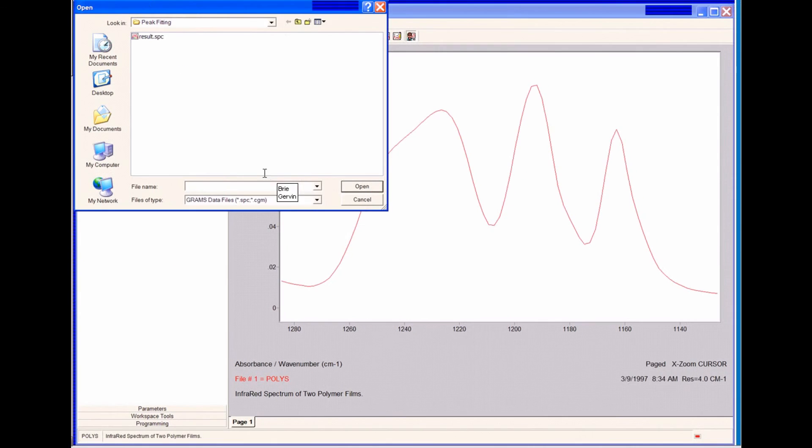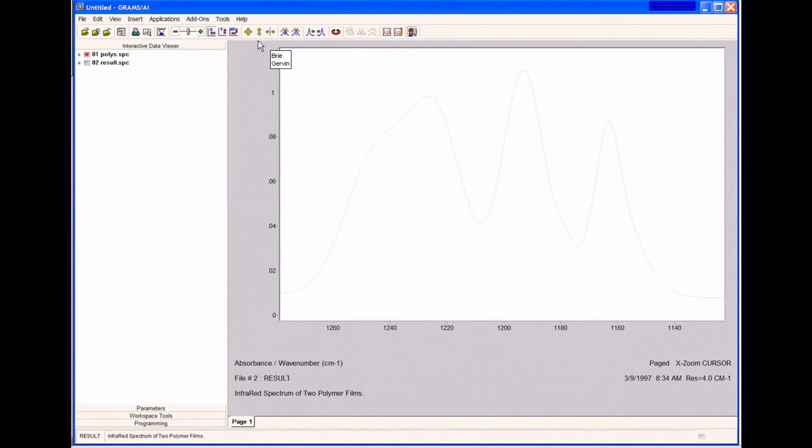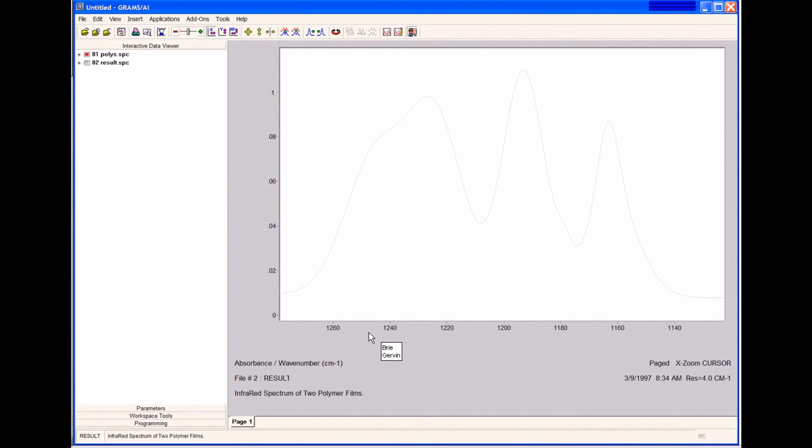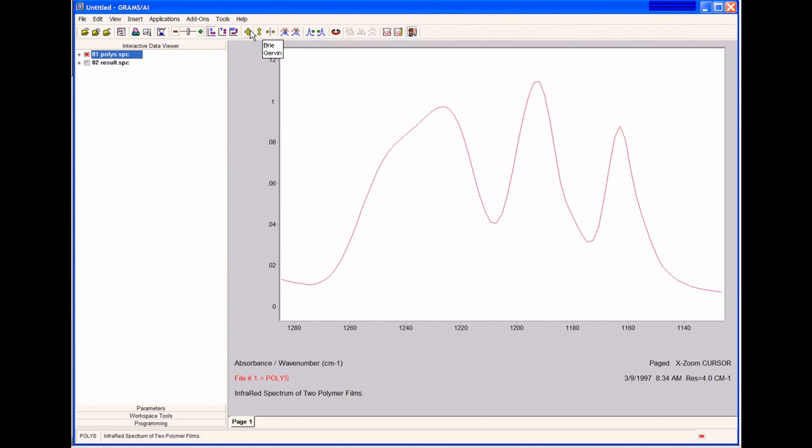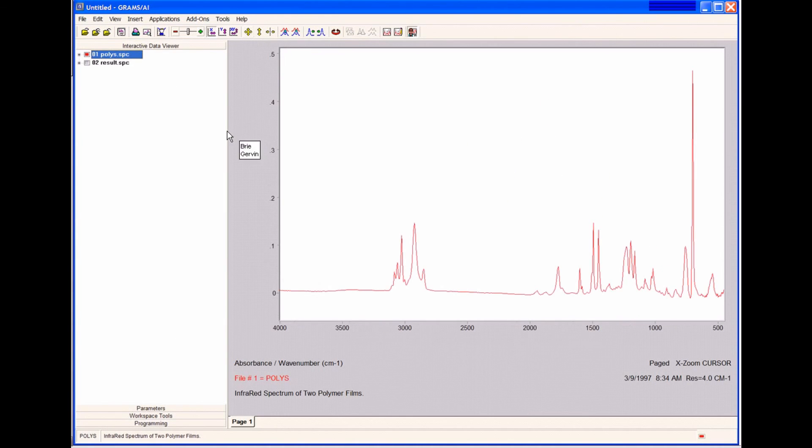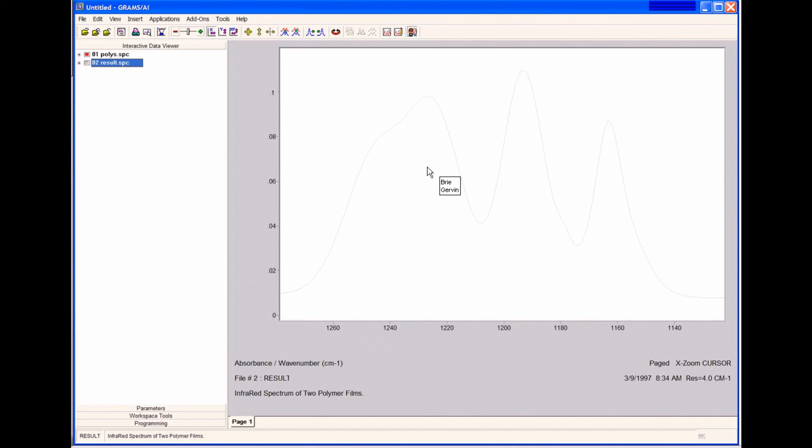If I go to Open Trace, if I click on Results here, and I'll autoscale so we can see it. This is our result trace. If I autoscale, you can see that the result trace only saves in the region that we fit in.